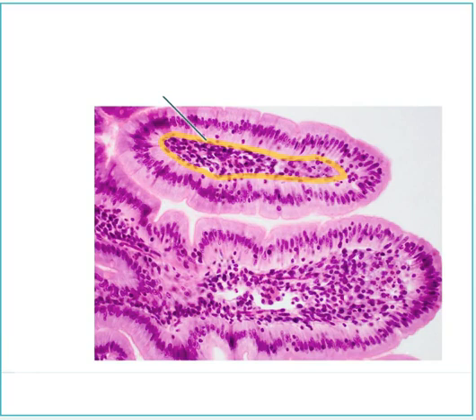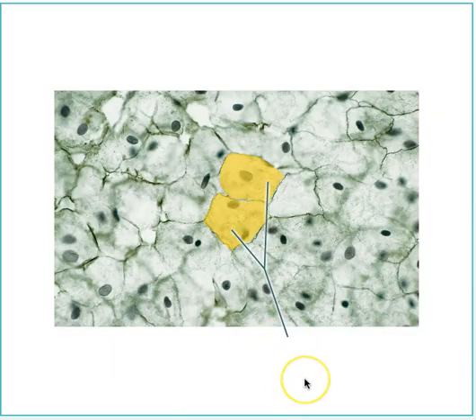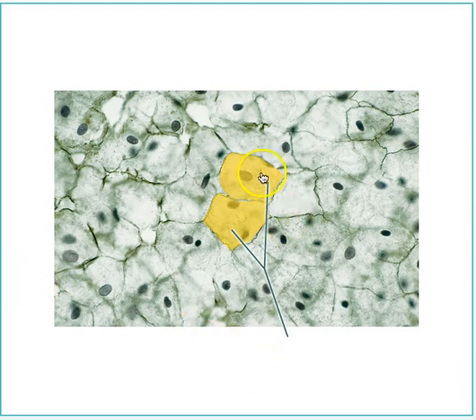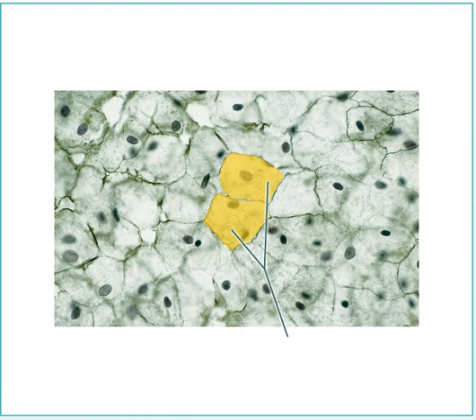Next. What is this cell type? And to what tissue type does this cell belong? So this is simple squamous cells from simple squamous epithelium. This more than likely came from an oral smear. This is one of the slides we had in lab.